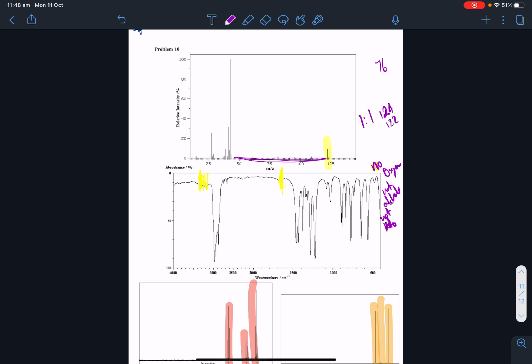All right. Hopefully you've got to the point where you're thinking of those isotopes. This is bromine. 1 to 1, where there's 2 difference, is a bromine peak. And it's hinting that the mass, because if we look at the mass of bromine, it's a large one, so it's about 80. Oh, so the two ones are on there. I don't remember what they are. Is it 81 and 79? Let's Google that. But I'm still very happy that it's bromine.